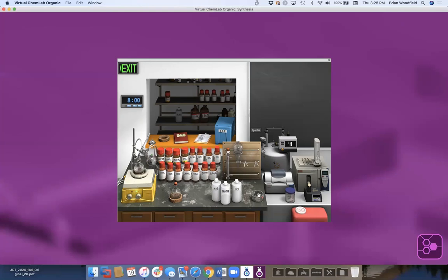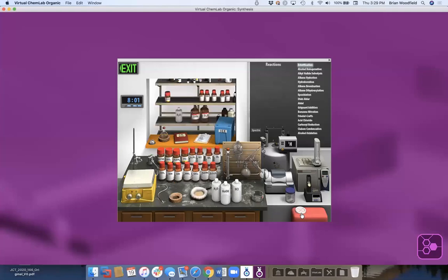We do have recrystallization. It's not very complicated. It's really a matter of taking light volatiles off as a way of just purifying the solid that maybe has some solvents or other in it. But it's not really meant to be a separation technique, except for the light volatiles. So that's just an example.